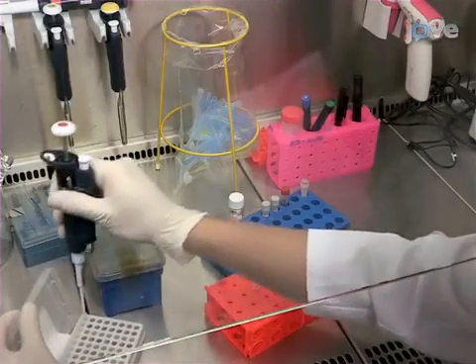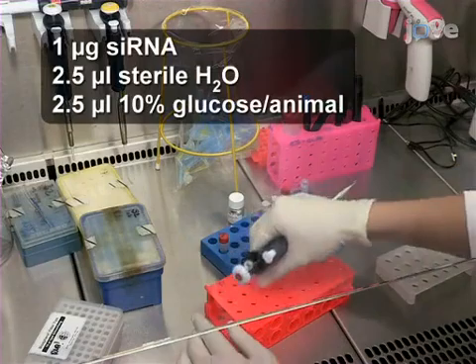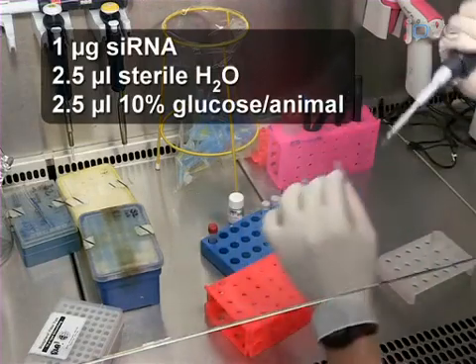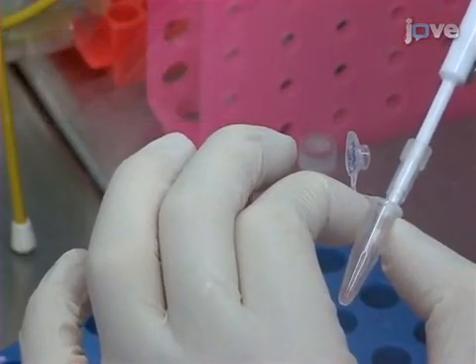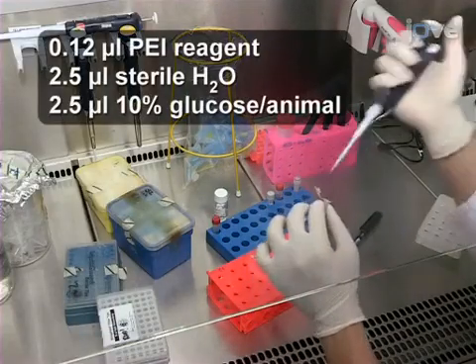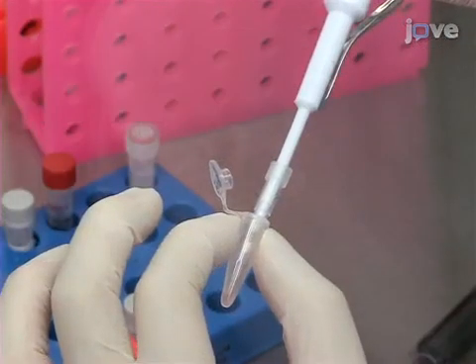To prepare the siRNA solution, begin by diluting the desired amount of siRNA with sterile water, then dilute this further with 10% glucose solution. Mix by pipetting up and down. To make the PEI solution, dilute the required amount of PEI reagent with sterile water, and dilute this further with 10% glucose solution. Mix by pipetting up and down.